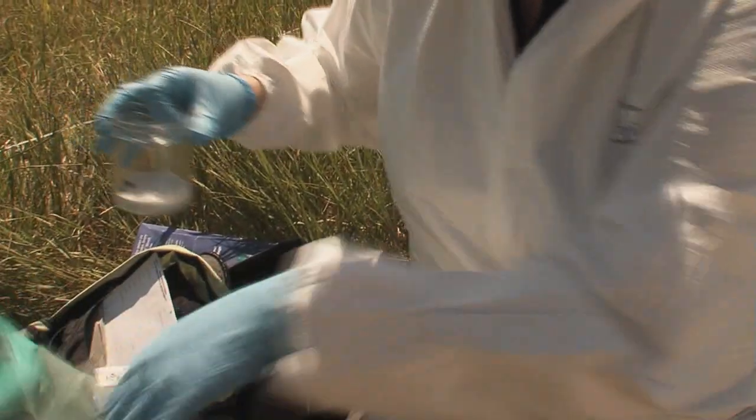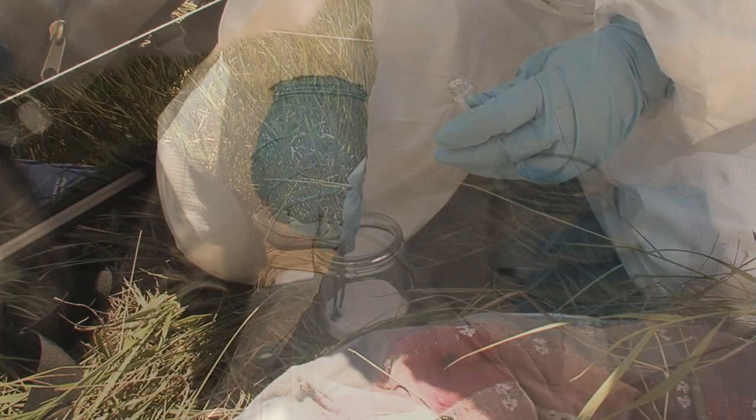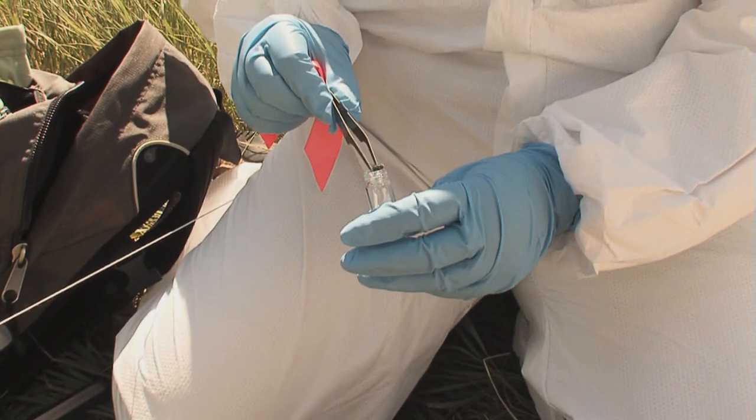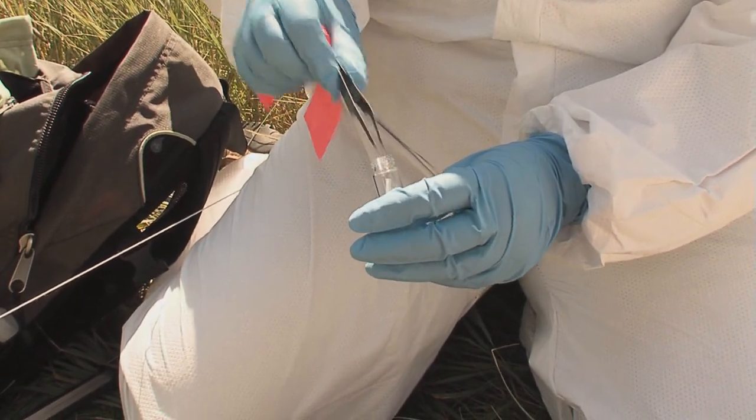Once the insects are killed in the killing jars, you transfer them to vials. That's true for the adult flies and adult beetles, as well as a preserved maggot sample that you will also collect.